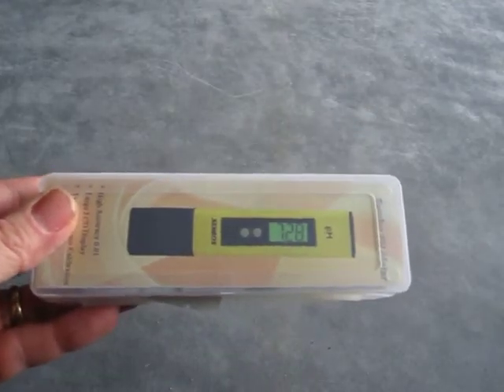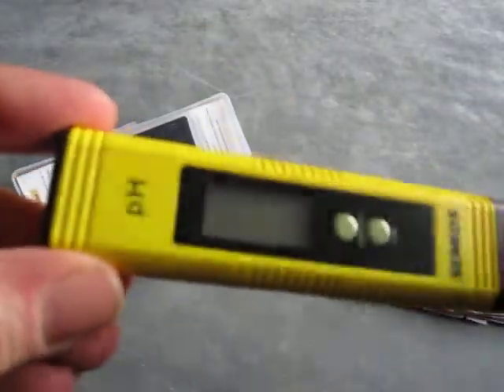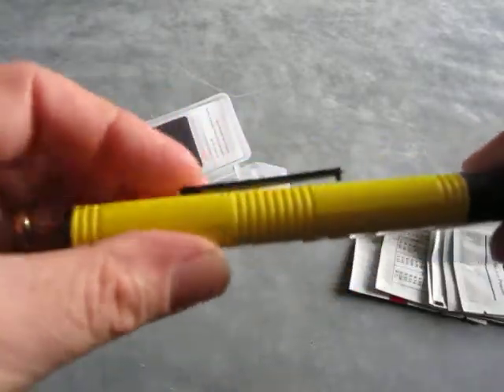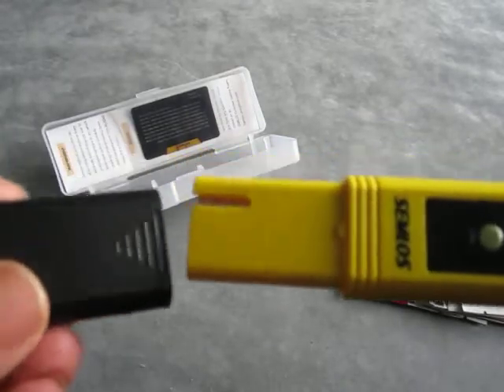You can get a very precise reading. It comes in a handy storage case, and what you'll find in the case is the meter itself. This comes with the batteries pre-installed. The batteries are changed via this top section here — it can be pulled out with a couple of button batteries in there. It's got a handy clip on the back, and the main probe is actually under this cover at the front.